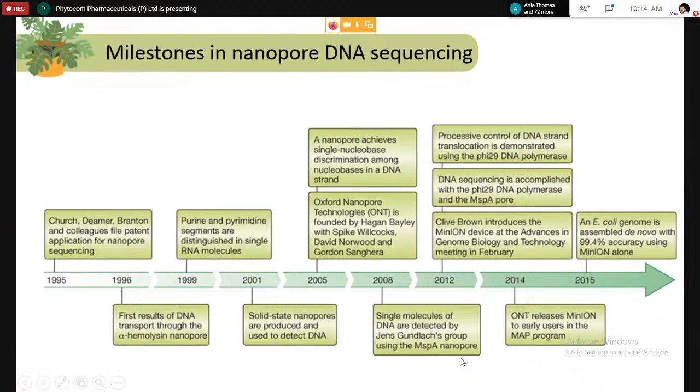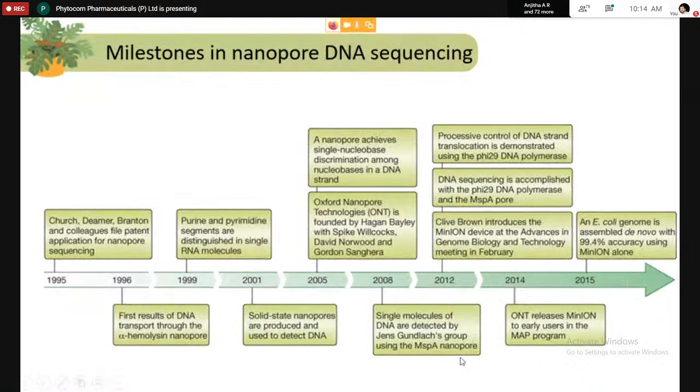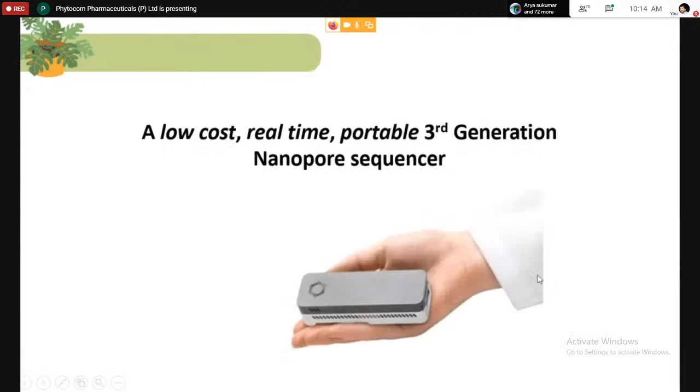Could read the nucleotides like A, G, C, T like that. So for that accuracy, they have mutated it. And the first instrument they have released is the MinION. So this is a small piece of equipment.